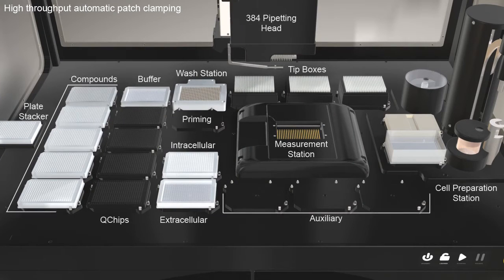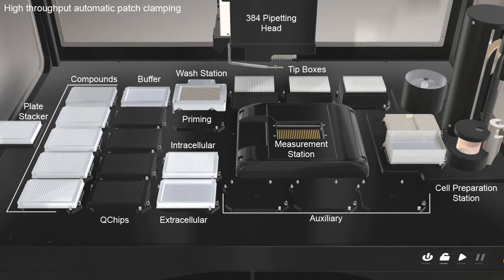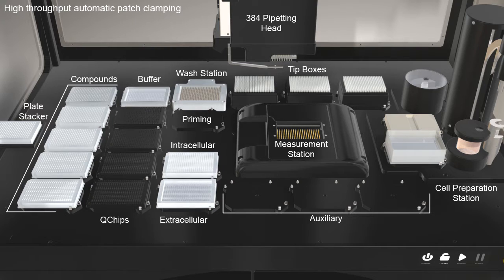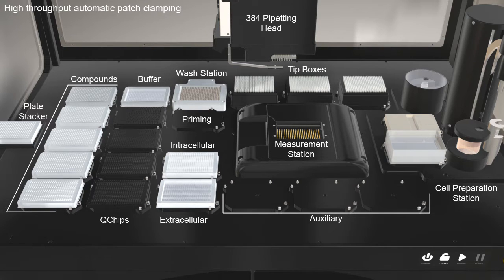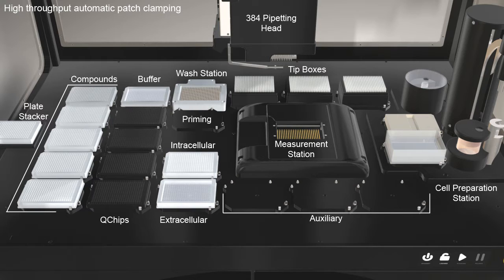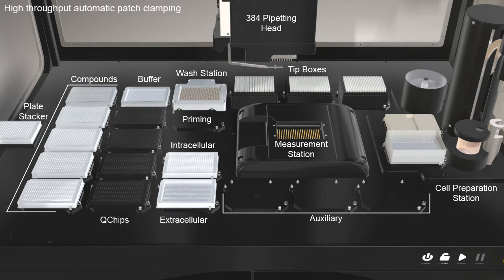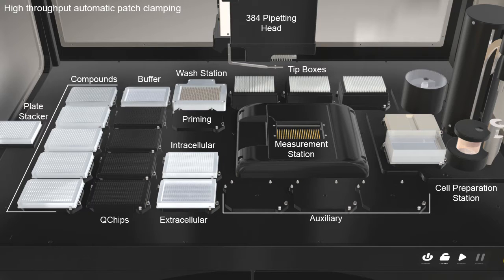Cube provides everything needed for fully automated and unattended high-throughput patch clamping. Looking from the left of the workplane, you can see the compound delivery area, the GigaSeal based Q-Chip 384, the 384 pipetting robot, tips for liquid handling, the measurement station, and the automatic cell preparation station.